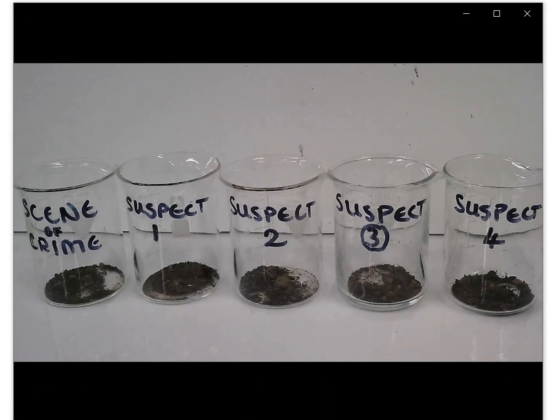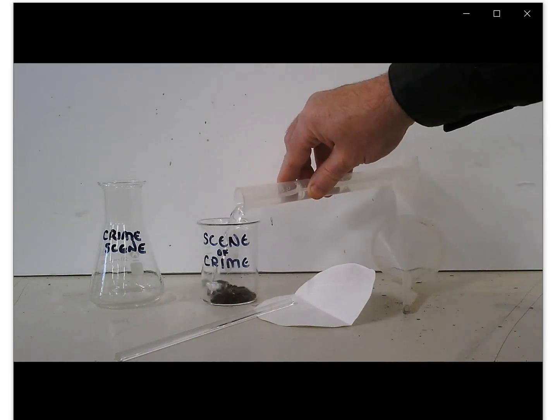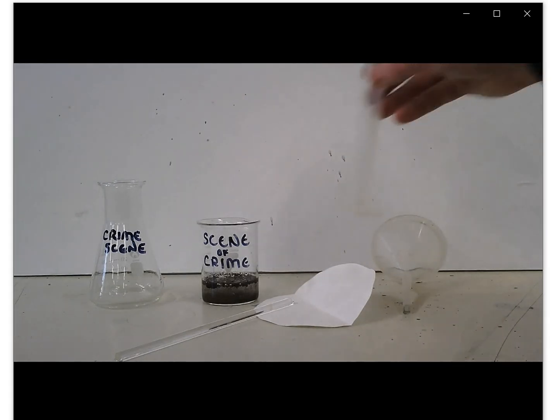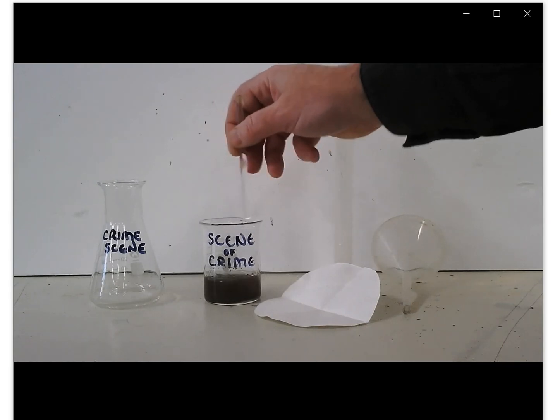So here's the samples, got the crime scene, and then the 4 suspects. So we're going to extract any acid or alkali from the crime scene. So we add our distilled water. Give it a really good stir, make sure it's all mixing.